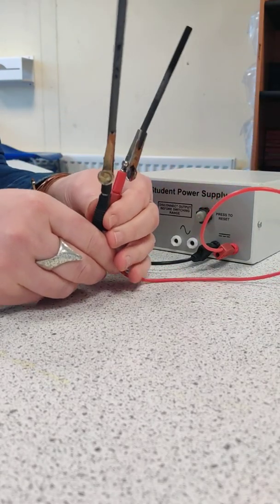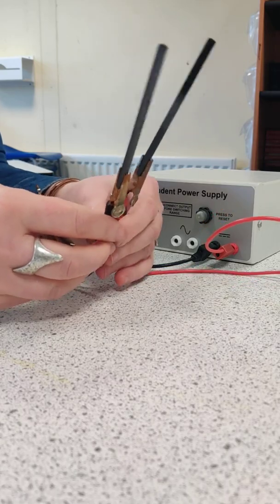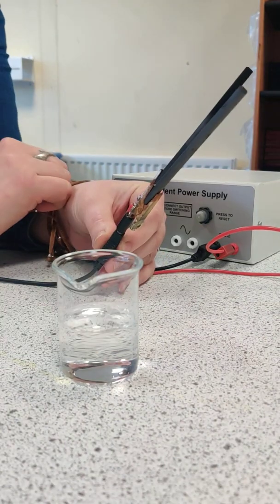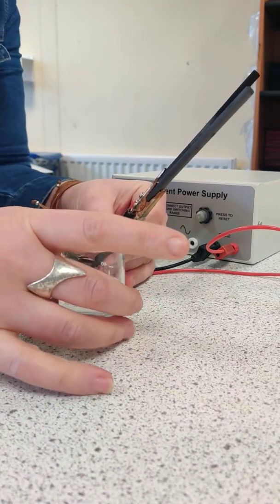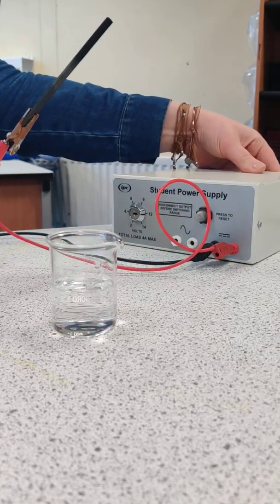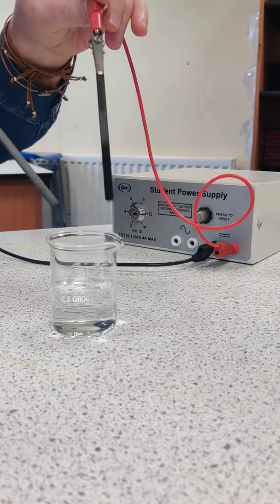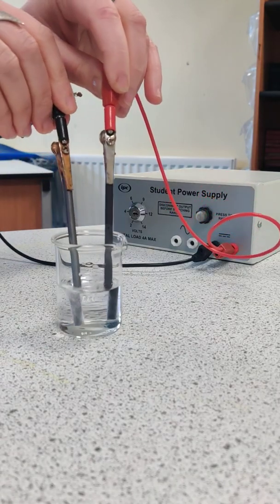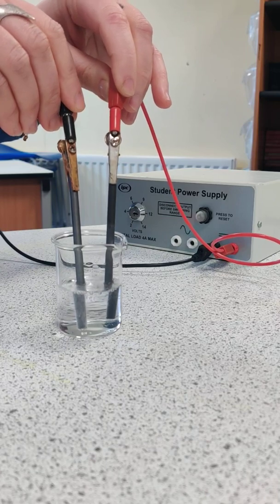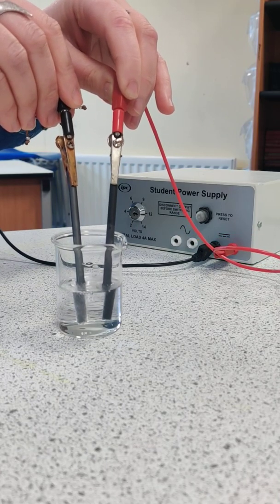So if we're going to separate compounds into their component parts we need something to separate. The example I'm going to use for the purposes of this is a beaker of water. I'm going to switch the power pack on and put both electrodes into the water — you can see fizzing or bubbling around both electrodes.